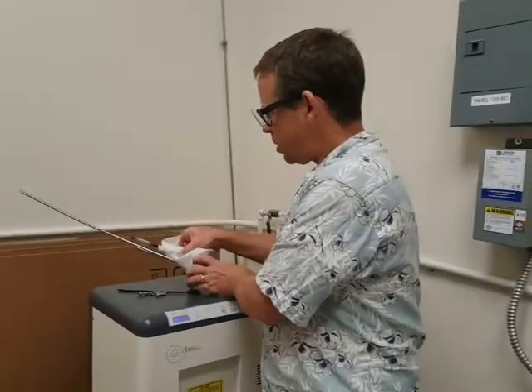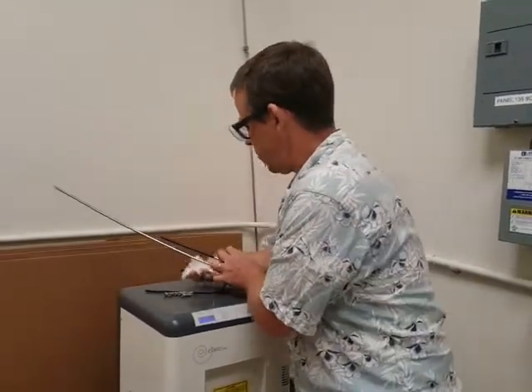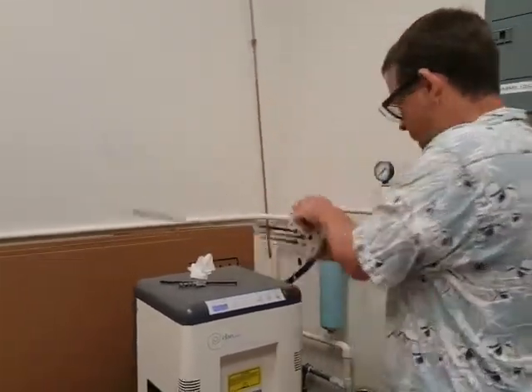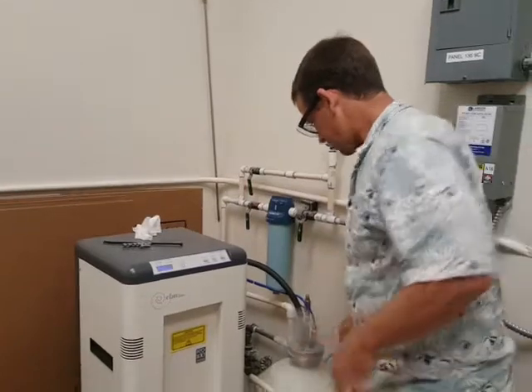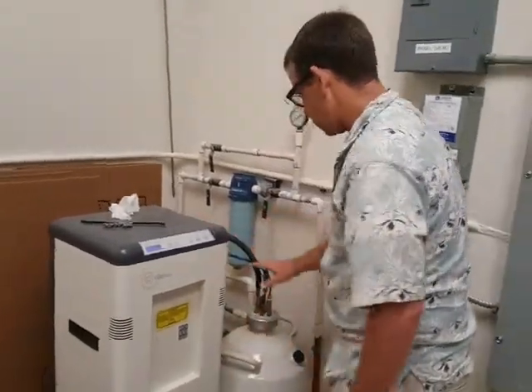We have some Kim wipes. You can use anything really as long as it doesn't leave behind residue. I'm just going to give these a quick drying before I gently put them back into there. I'll adjust this so that it minimizes the strain here.